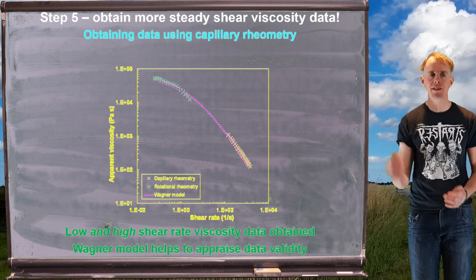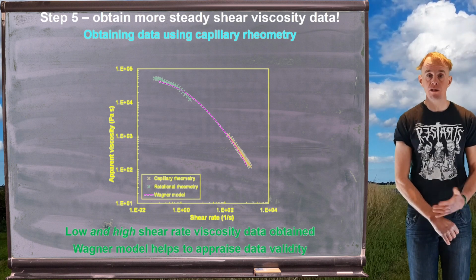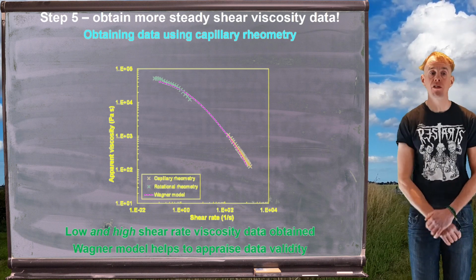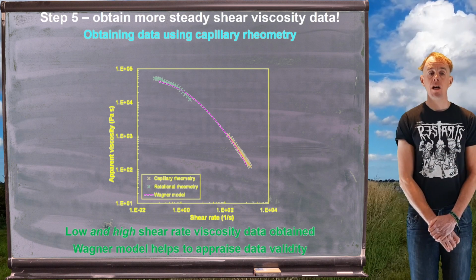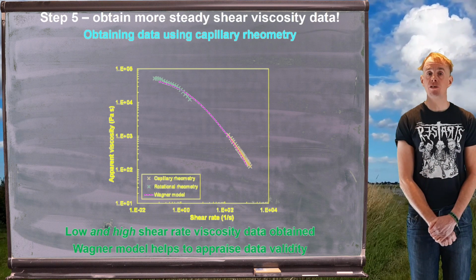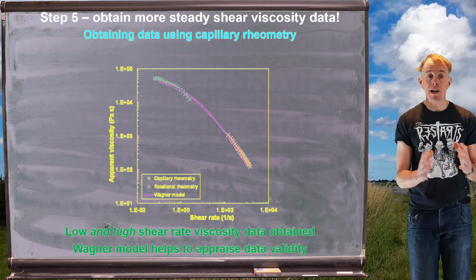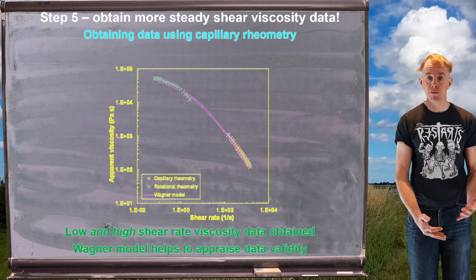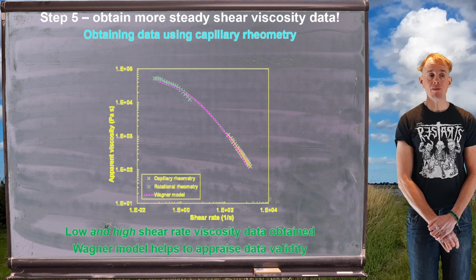These steady shear data we can simplify maybe with a generalized Newtonian model. Maybe we might fit a Cross model to something like this, because that will capture that low shear rate Newtonian plateau. Or we may find that the characteristic shear rates of the process that we're interested in doing some calculations around are well in the power law region of this model. And so we can simplify the calculations greatly by making that realization.